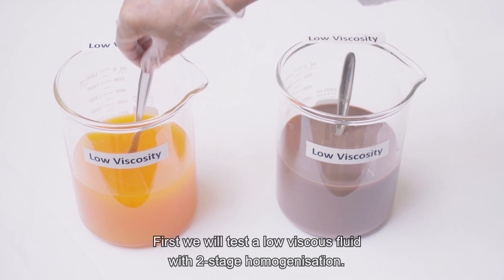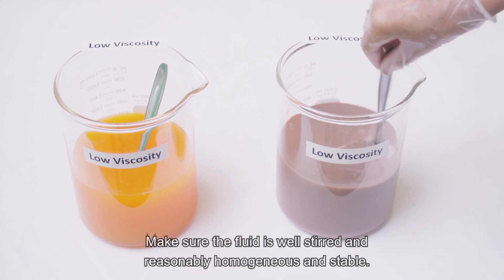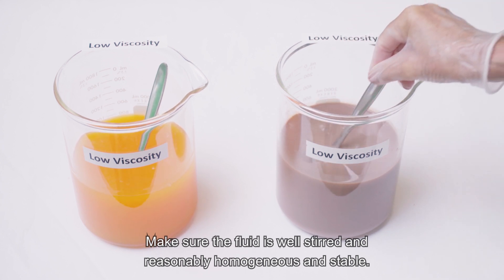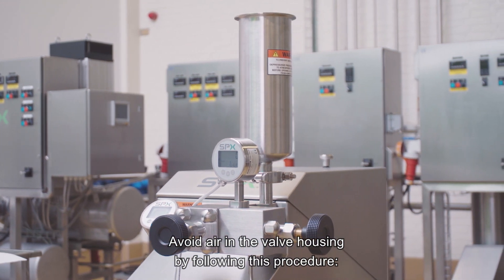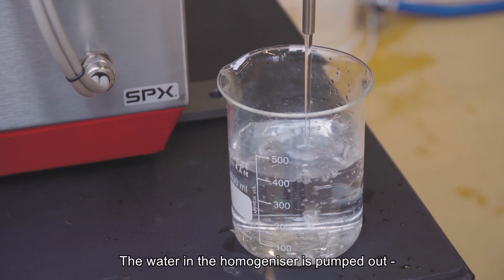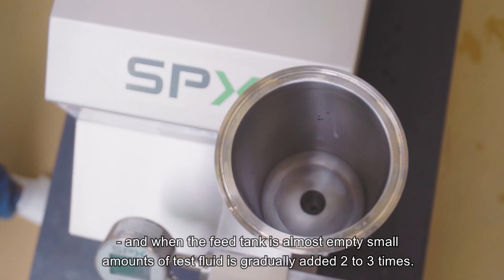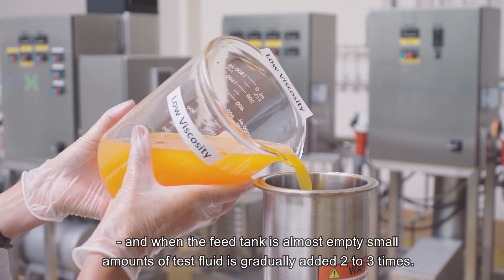First, we will test a low viscous fluid with two-stage homogenization. Make sure the fluid is well stirred and reasonably homogeneous and stable. Avoid air in the valve housing by following this procedure: the water in the homogenizer is pumped out, and when the feed tank is almost empty, small amounts of test fluid are gradually added two to three times.